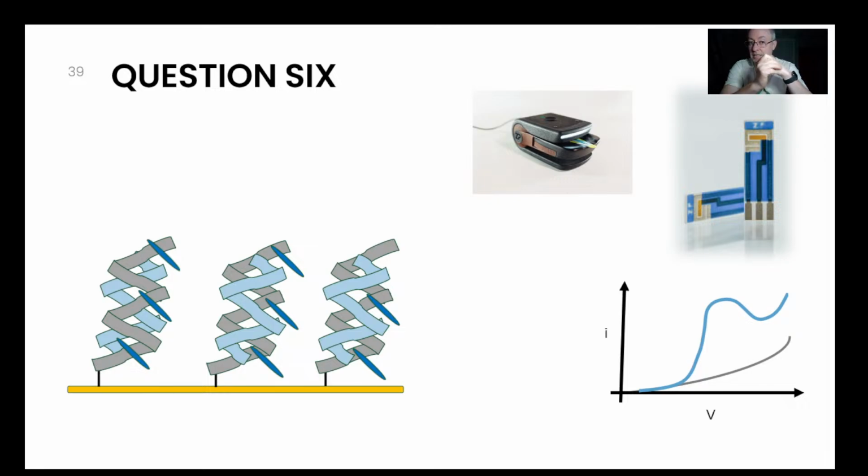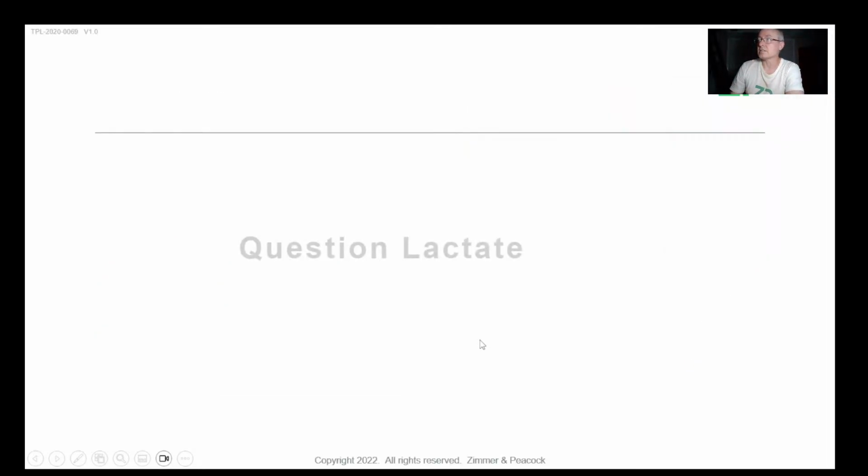If you want to know whether it's hybridized or not, adding a molecule like methylene blue that can intercalate is a way of, first of all, knowing the hybridization has taken place, and the amount of intercalation, and therefore enrichment of that methylene blue near the surface, is an indicator of the amount of hybridization going on, and so of the amount of target, for example DNA, that you had in that sample.